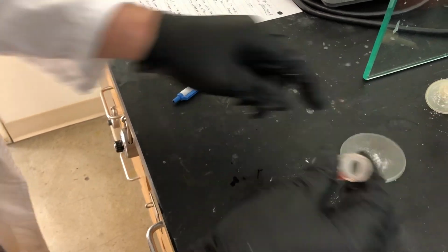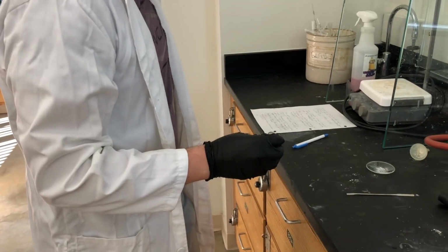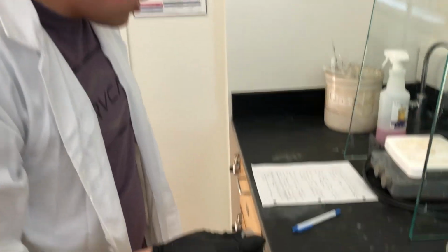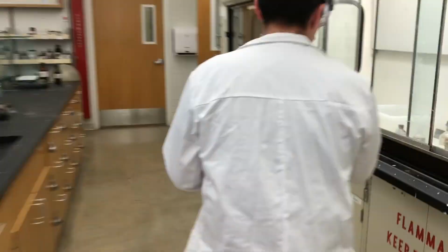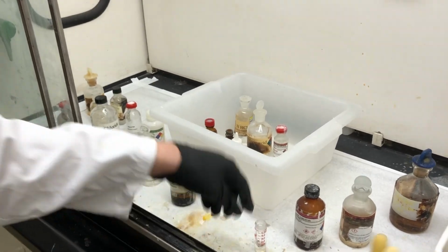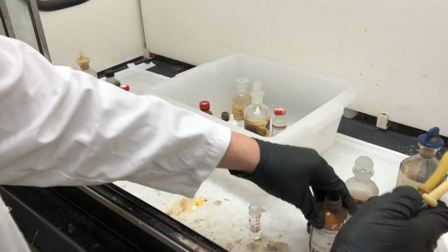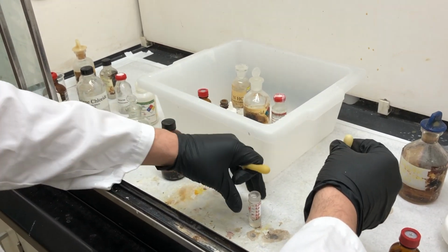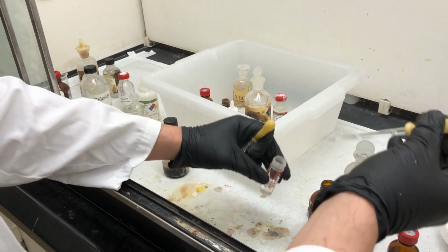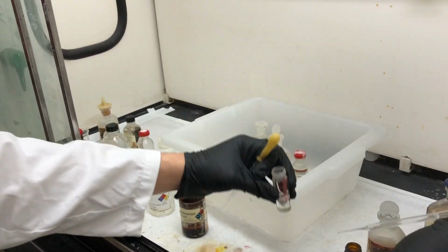Okay, so that's in there, and now we're going to add 0.5 milliliters of acetic anhydride and 1 to 2 drops of 85% phosphoric acid from the hood. I'm going to take my pipettes. Okay, so here's acetic anhydride. We're going to add about 0.5 milliliters, so about a little less than half a pasteur pipette, or let's see, about that much.